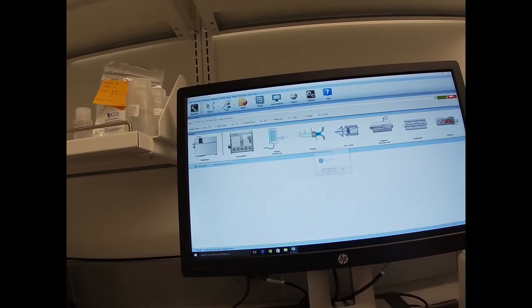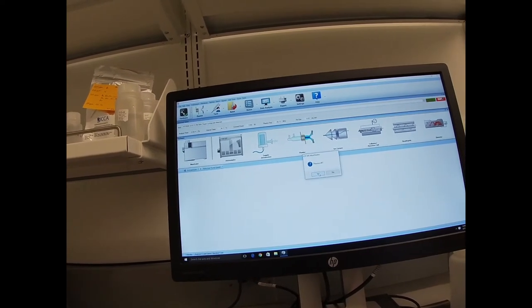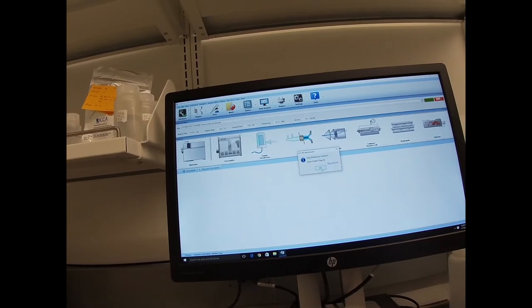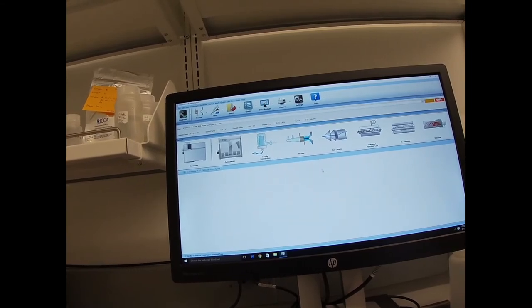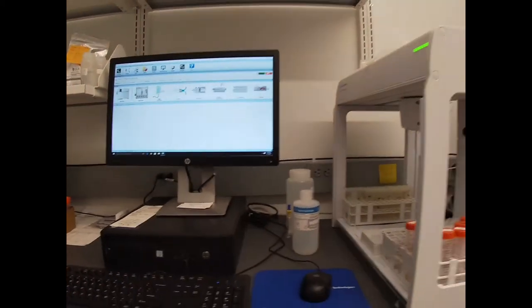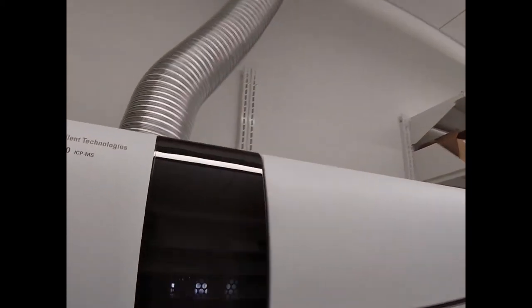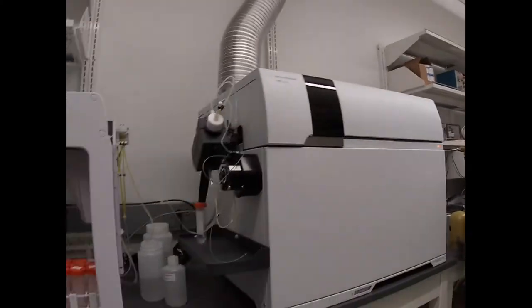So once the plasma is shut down, I can introduce you to the rest of the system and walk you through all those elements that I ran through in the software. And here we'll see it extinguish. Excellent. Now let's move on to the system itself.